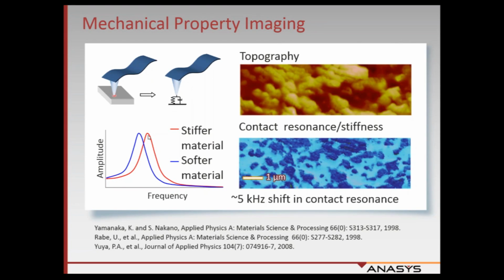In addition to chemical information, the system also has the capability to make mechanical property measurements because of how the tip oscillates.